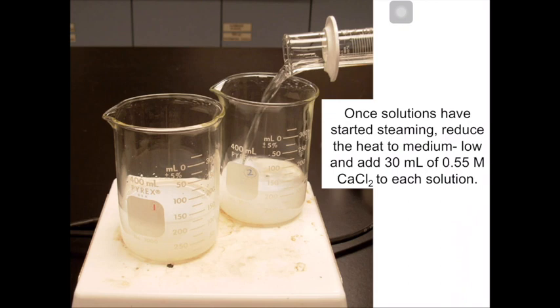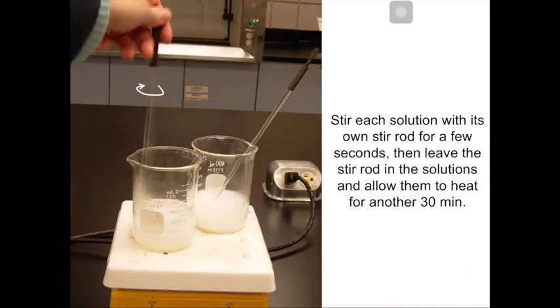What is being done here is adding the precipitating agent, which is calcium chloride. As you can see, the solution turned cloudy, which signifies the formation of precipitates. Stir the solution with its own stirring rod for a few seconds, leave the stirring rod in the solution, and allow it to heat for another 30 minutes.